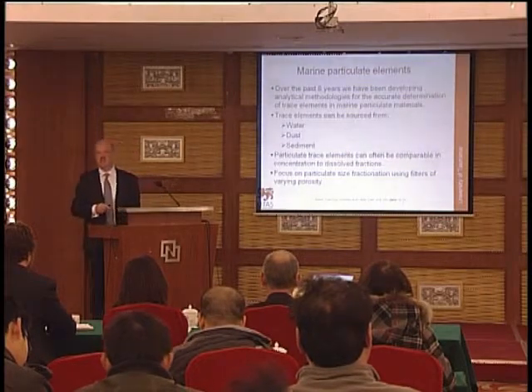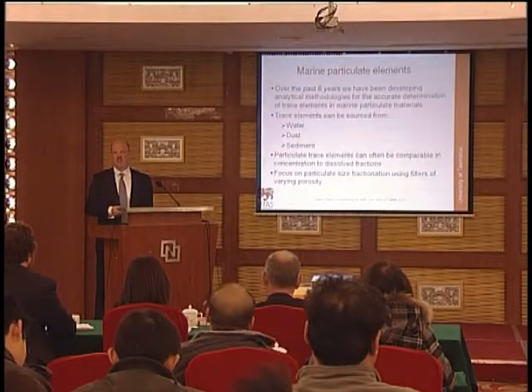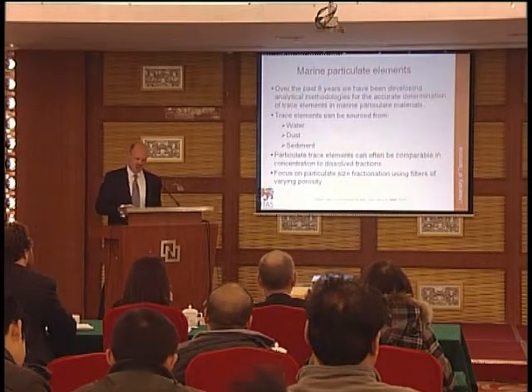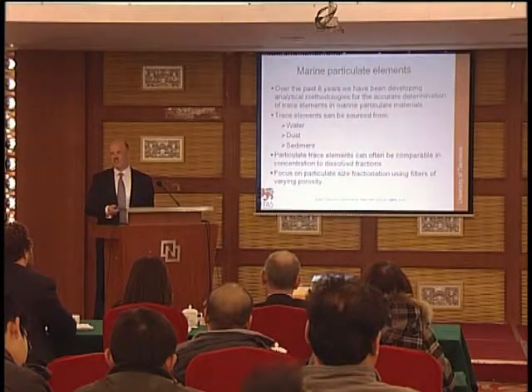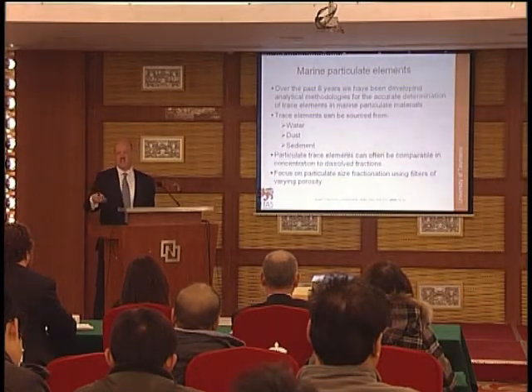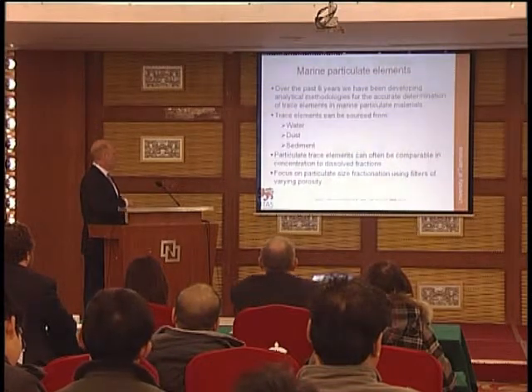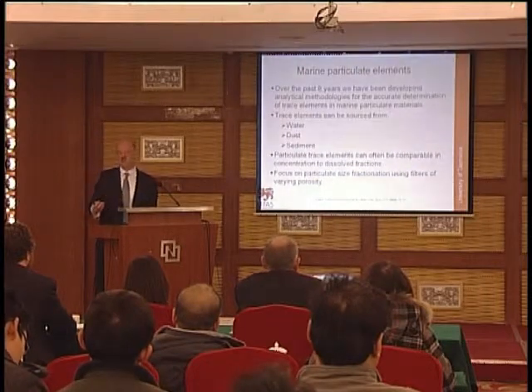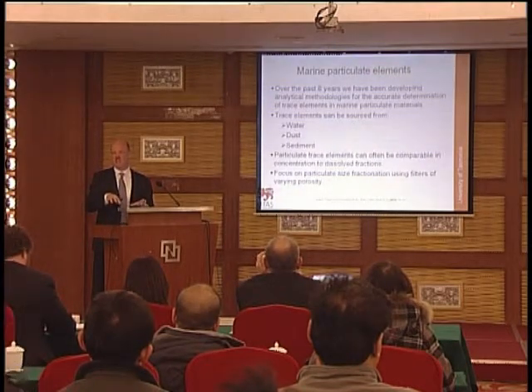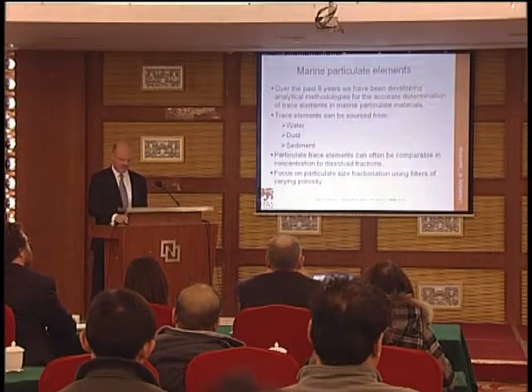For the past 8 years, we've been looking at methods of analysing trace metals in marine particulate materials. A lot of work elsewhere has been done on the dissolved metals and processes that have been associated with that. But the other aspect of where the metals get provided to the world's ocean is off sources such as land masses, such as dust from volcanoes, from deserts, undersea volcanoes and the sediments themselves, or metals that are actually in the water themselves. And the trace metals, the particulate levels can often be greater than what is naturally dissolved there. And we've been using filters and fractionation and porosity size effects on filters to try various, if you like, fractions or slices of what's floating out there in the ocean.